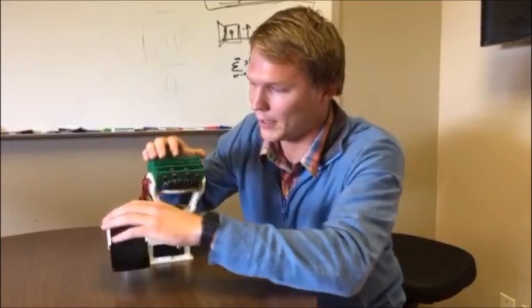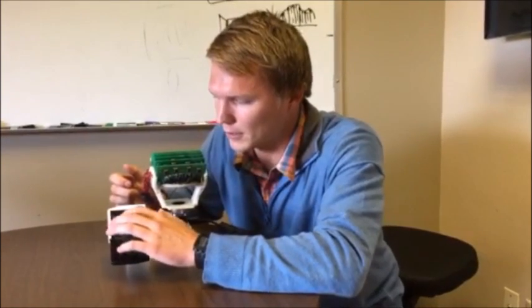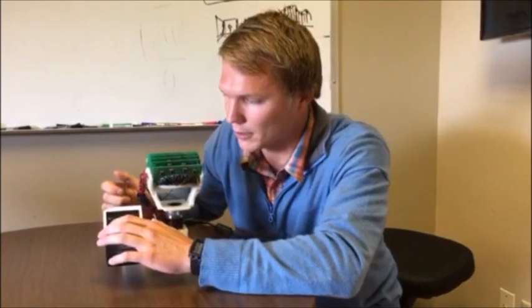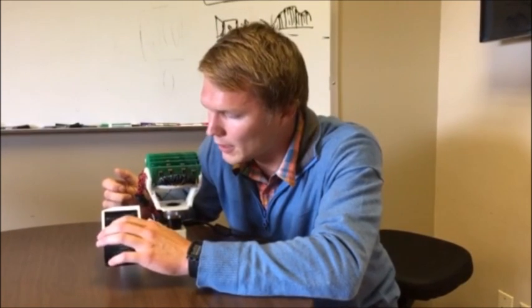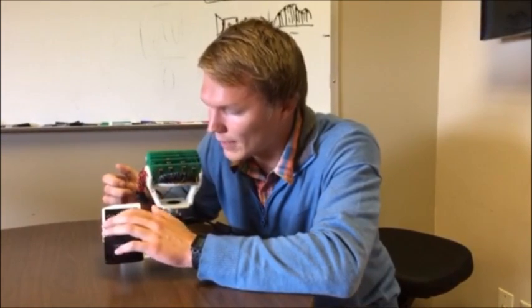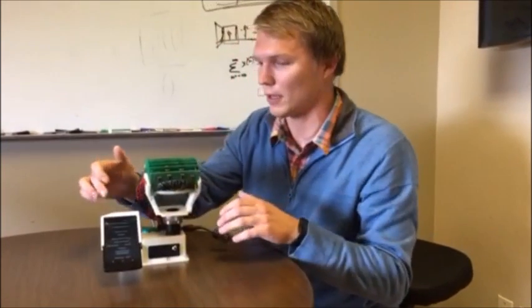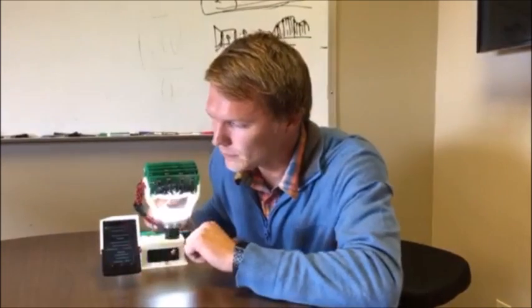So this is all controlled by a smartphone application that we've developed this past year. It's sort of a joint project between myself and several undergrads, and also Dan Fletcher's group. So if I start up the app, I have to connect to the array. There's a Bluetooth connection, totally wireless, between the cell phone and the LED array.